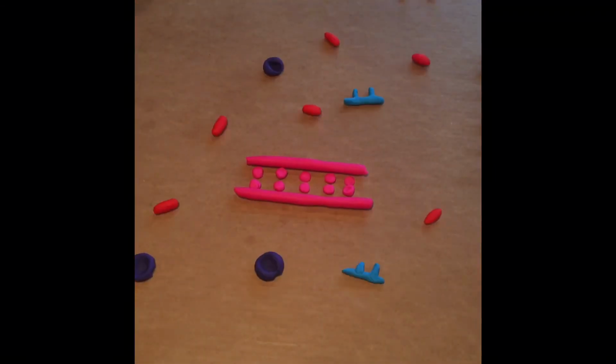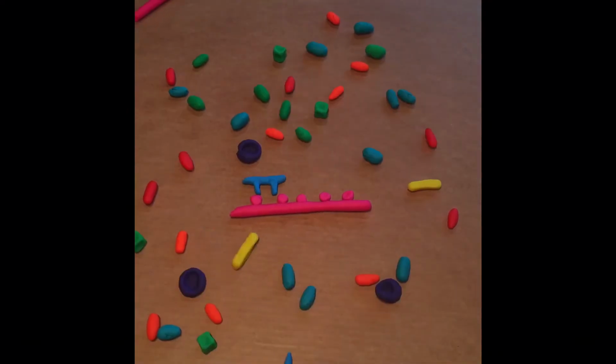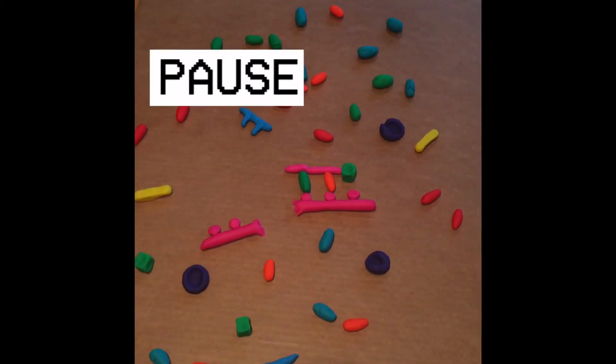Let's take a molecular level look. Too fast? Sorry about that. You might be a little bit confused. Why does it look like DNA replication, but weird? Isn't this just PCR? What are those square nucleotides? At a slowed down rate, we can stop and really see what's going on.